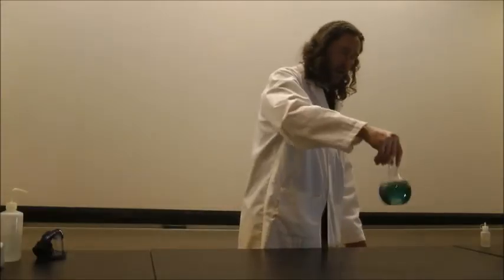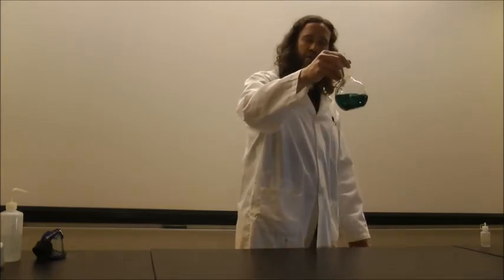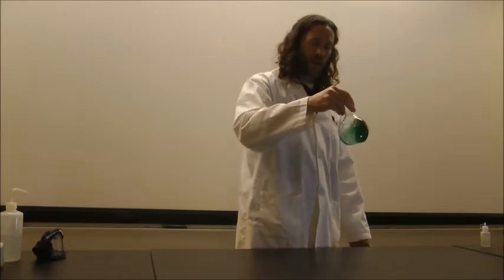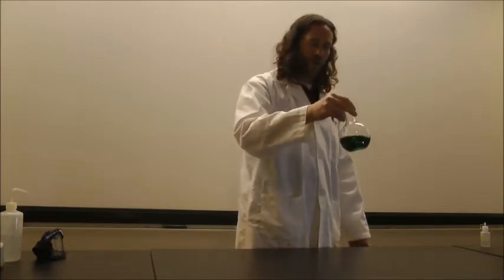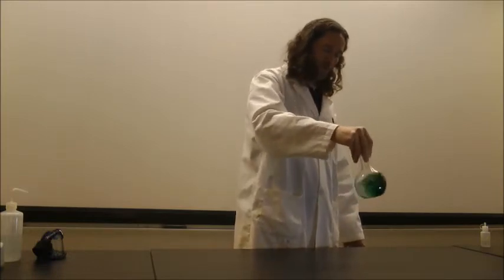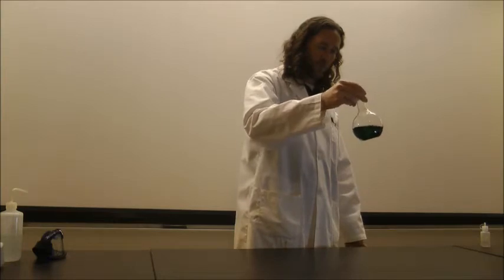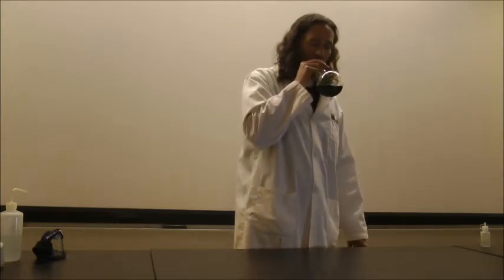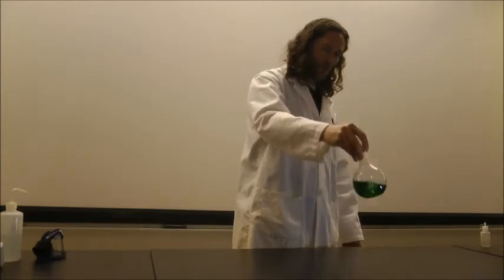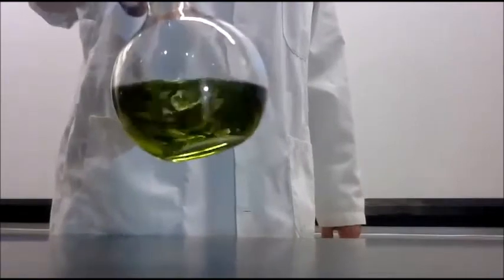But now I'd like to reverse that process. I'm going to take this solution and make it acidic again. And I'm going to do that by just breathing out into the flask. Maybe you can see there we're already getting a little bit of a change in the color of the solution.